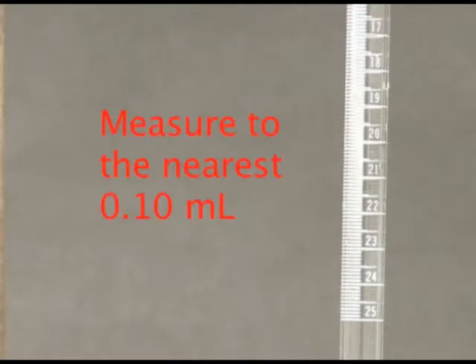We use burettes to measure the amount of solution accurately to 0.10 milliliters.